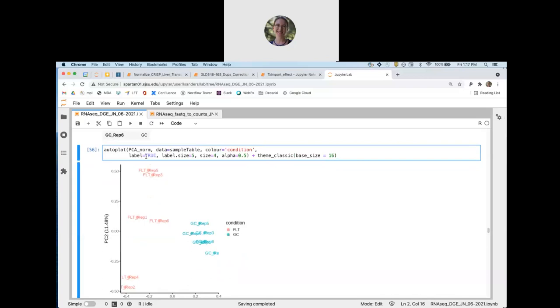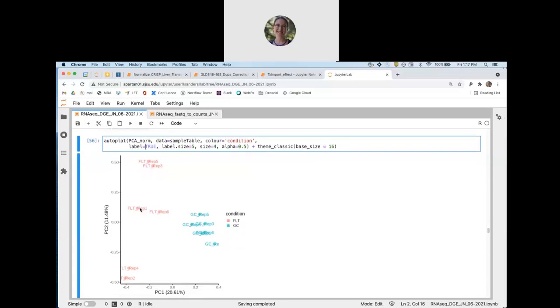There's a book on ggplot that's like 150 or 200 pages because it's so specific, and you can make plots look exactly how you want them to look. But that means there are tons and tons of arguments and different layers that you can add. So I can send around documentation that we can read about ggplot, but if I were to try to go into that right now, it would probably take way too much time.